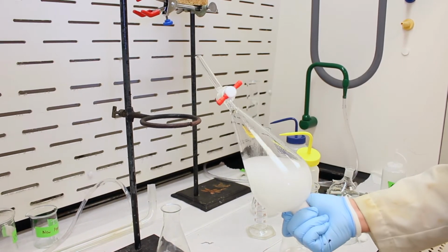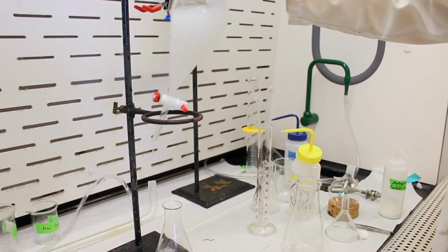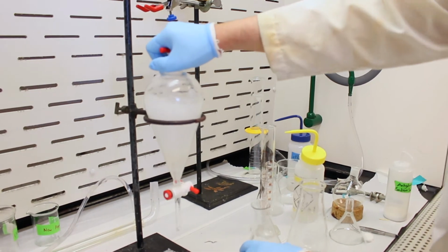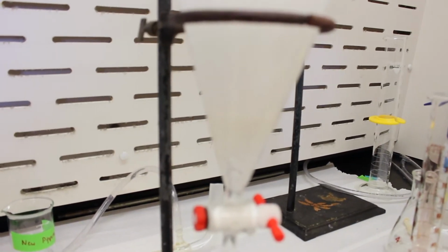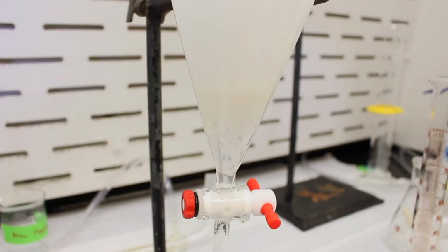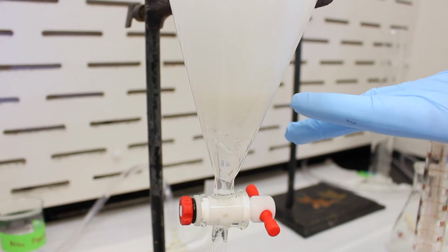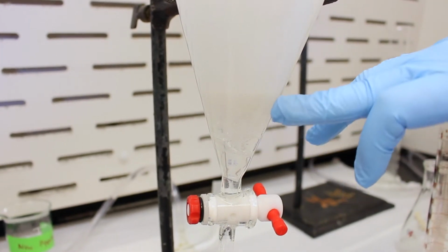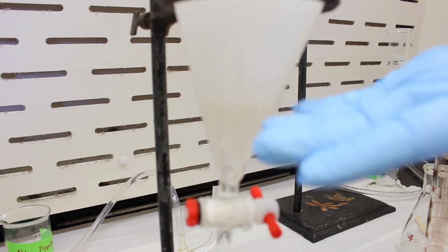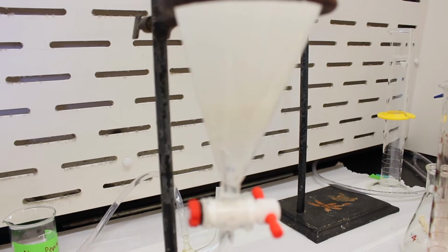Now if you shake too vigorously, you might get an emulsion, which hopefully we don't have here. So let's find out. Let's see. You can see we have a little bit of an emulsion here. You can see I shook it pretty hard. I like to shake it hard. I like to live dangerously. And we have a little bit of an emulsion, so where the layers separate is not very clear. To resolve that, we're going to add some brine.